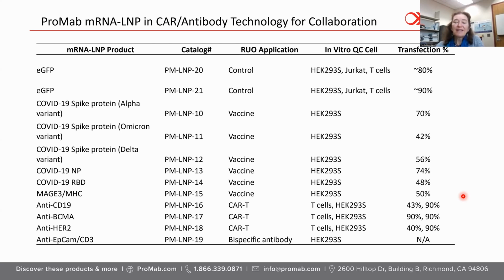Wow, thank you, Victor, for sharing your experience. It's very incredible, especially the transfection rate is so incredible. It can go up to 90% of the cells, for example, the control one. So is there any special kind of treatment to achieve the 90%? Do we need to pre-treat the T cells, for example, before transfection, or can we just run it right after fresh T cell separation and also achieve this incredible transfection efficiency?